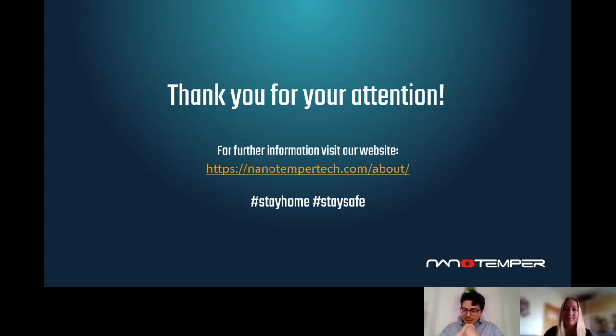Thank you. And another question, a bit more general. You showed us that most of the research targets different steps of the viral cell cycle, and you gave nice examples of two specific steps. I was wondering if you could briefly elaborate on whether MicroScale Thermophoresis can also be helpful in other steps of the viral cycle, and how. Yes. Of course, you can use our technologies in all of these different steps. You can study protein-protein, protein-RNA, protein-DNA, small molecule and ion interactions, the interactions with whole viral particles, as I showed you, and the effect of glycosylation. Actually, you can study whatever you like. What you just have to keep in mind is that one of the interaction partners needs to be fluorescently labeled. But if you can manage that, then you can do nearly whatever you want.